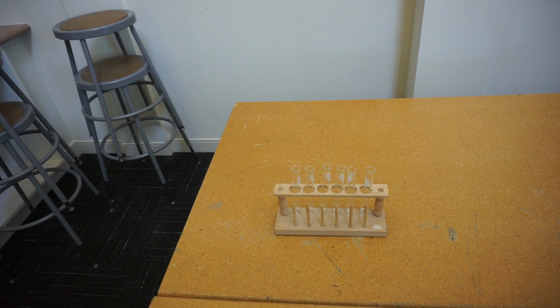So if we look at the test tubes on the bench, we have, going from left to right, methanol, ethanol, propanol, butanol, pentanol and octanol. So the first question, how many carbons are in each of the alcohols that we have?